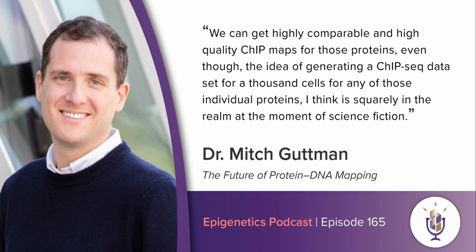Okay. And primarily, the reason we don't see that, we think, is because of the sterics of the beads themselves. The beads are about a micron in diameter. Simply getting multiple of them to bind on the same chromatin fragment just seems to be sterically not very common. And so that doesn't seem to be the case.